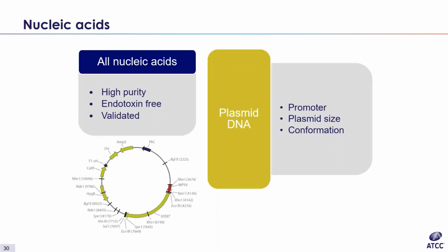So a little bit more on transfection best practices. For nucleic acids, which are DNA or RNA, one should use high purity and endotoxin-free material to achieve the highest transfection efficiency possible. Endotoxin appears to lower transfection efficiency. For DNA, one should verify promoter strength for the given cell being transfected. Certain promoters are known to work better with certain cell types.